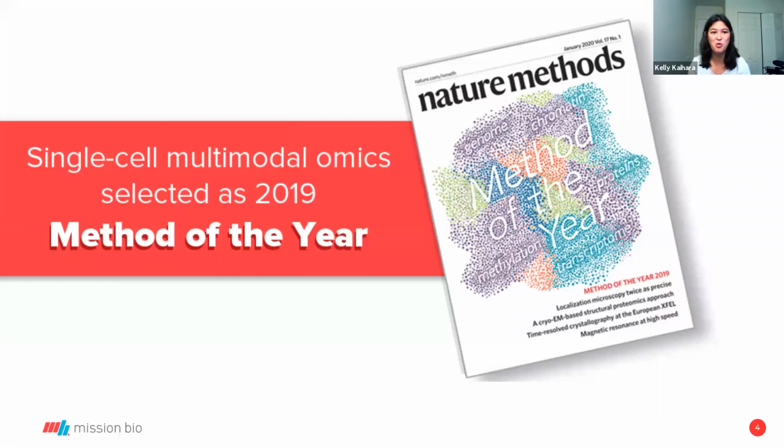We're starting to layer more analytes, including single cell DNA-seq, ATAC-seq, and protein-seq. It's been a really interesting and beautiful phenomenon to follow how this field has exploded in the last 5 years, and we at Mission Bio are really excited to be a part of this explosion of new technology.